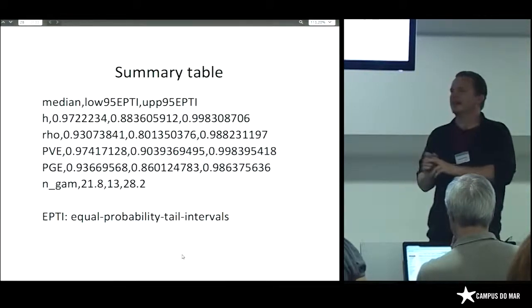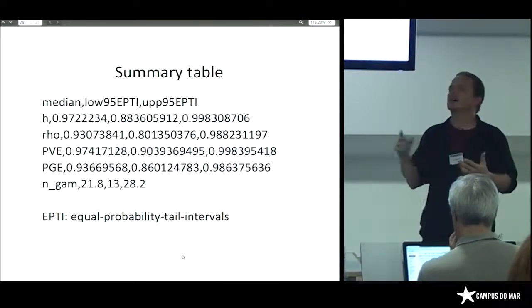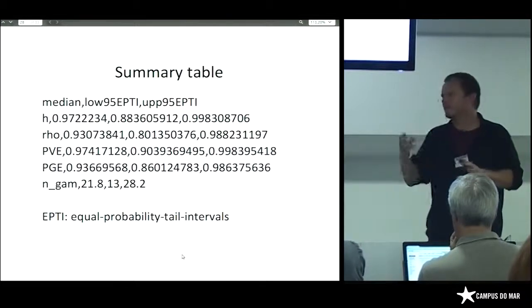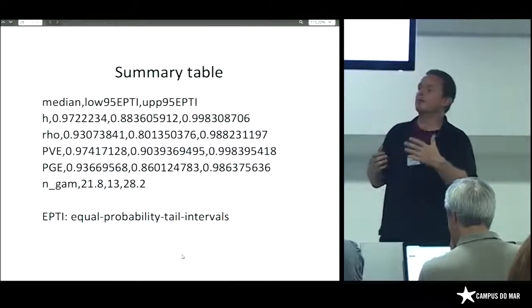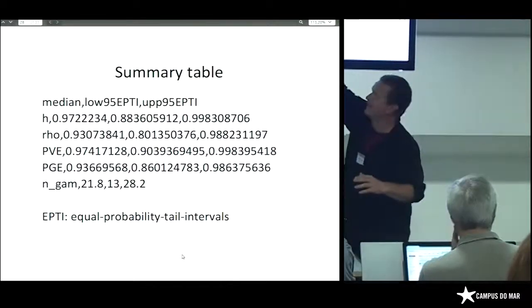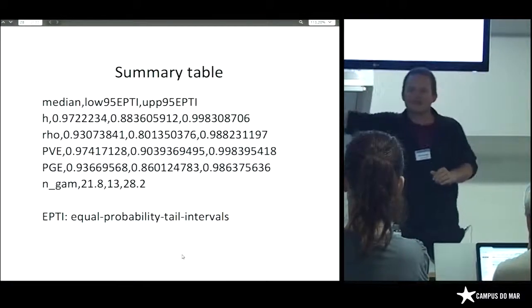how does that work out? And if it finds that it can't find a good model, it'll say, okay, maybe that's no good. Let's try it with 2 SNPs having a large effect and everything else does nothing. And then it will try with 3 SNPs, 4 SNPs, 5 SNPs, etc. And it will cycle through. In the end, it will stabilize on what it thinks is the right proportion of SNPs that have no effect. In this case, it's saying that 97% of all of our SNPs have zero effect.